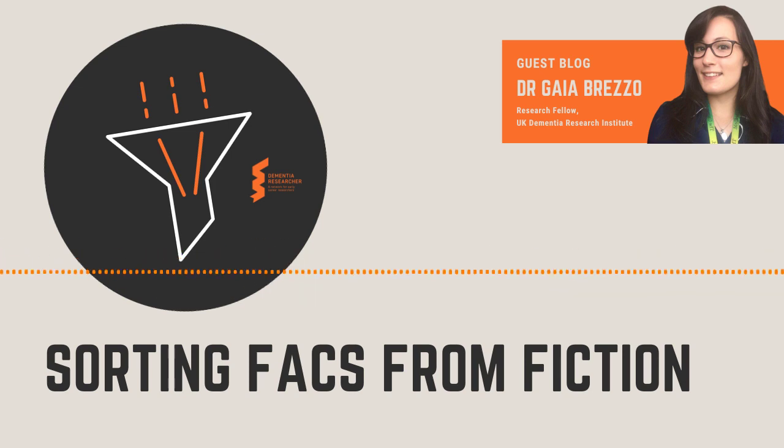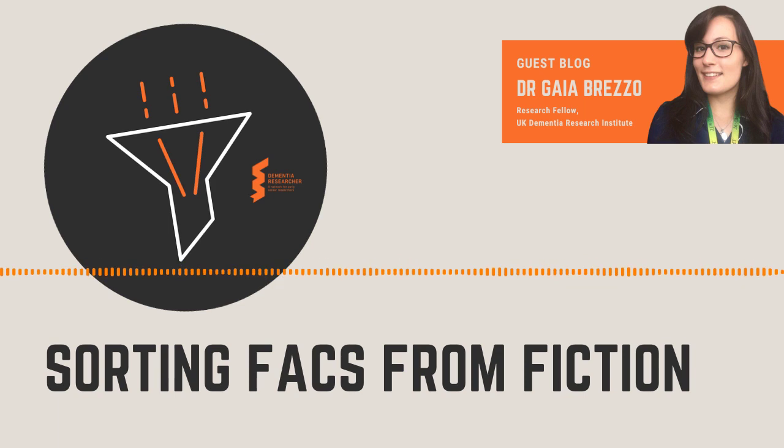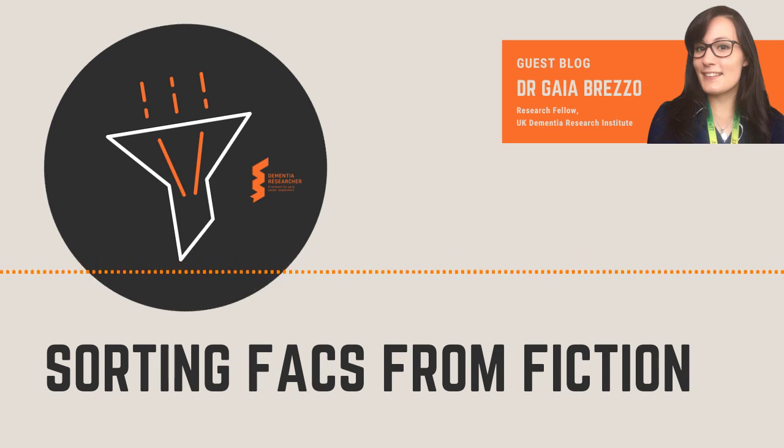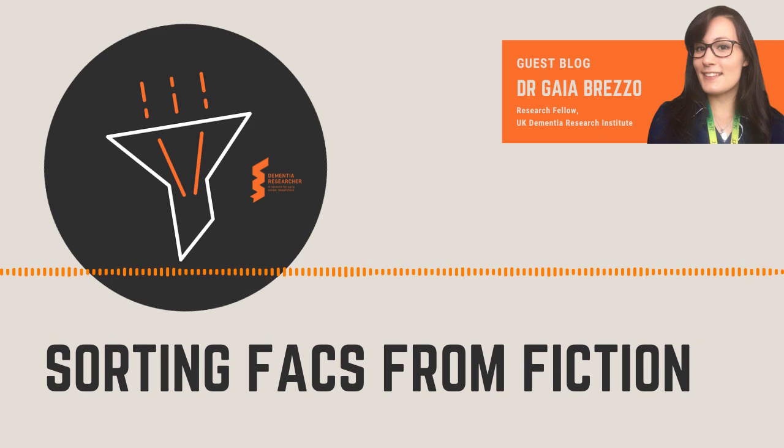Firstly, let's start from the basics. Fluorescence Activated Cell Sorting, or FACS, is a technique used to physically isolate or sort individual cells from a mixed population and analyse their properties. Its popularity in molecular sciences is driven by the fact that it's highly versatile, extremely high throughput, and allows a multiple parameter analysis of individual cells in real time.